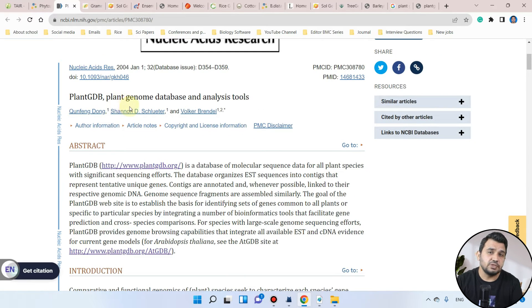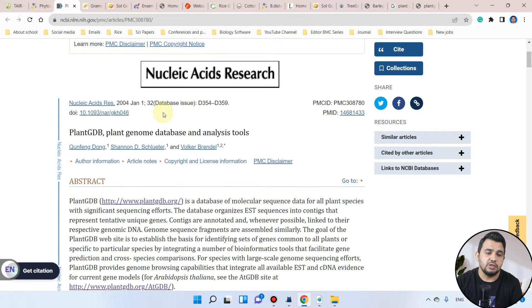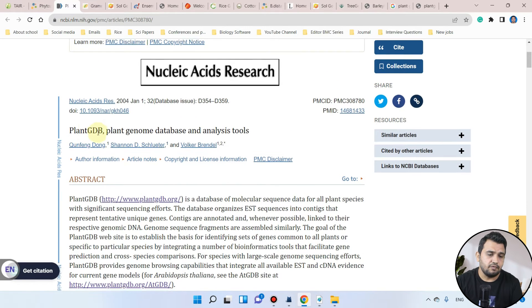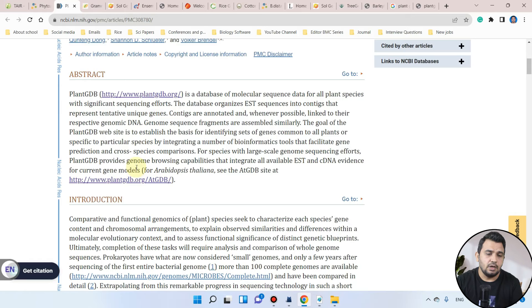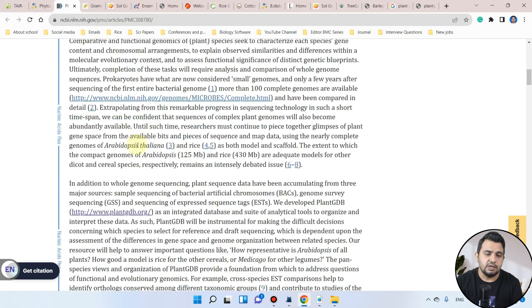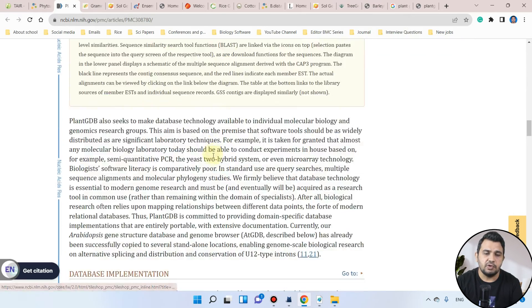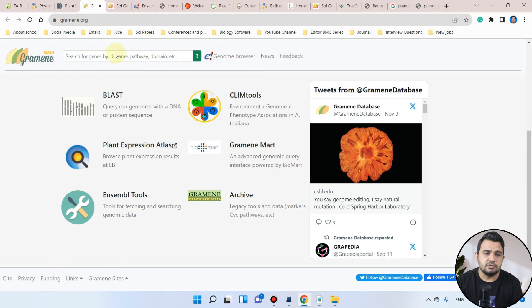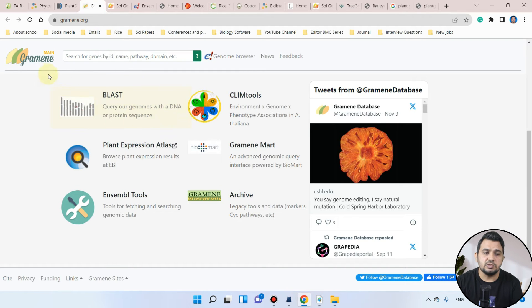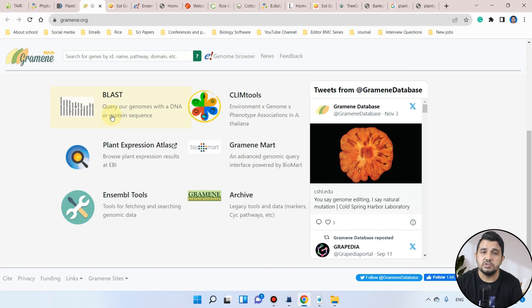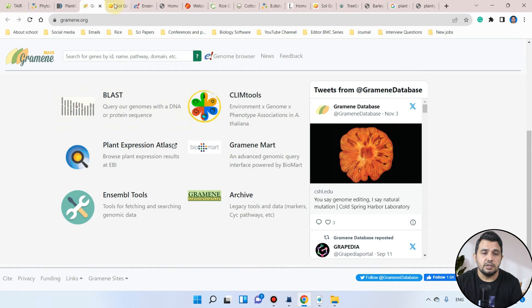Because the PlantGDB website was not working, I am showing you the research article which reports it for the first time. Here you can see the link and how we can use it. The next one is the Gramene database, where we will be using its BLAST function. You can see it supports querying genomes with both DNA and protein sequences.